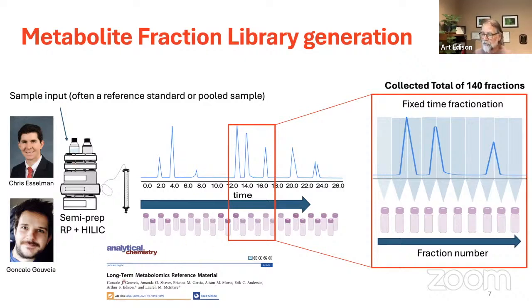I put down here at the bottom a reference from a paper that Gonzalo published while he was in my lab on defining a long-term reference material that I think many of you might find useful. I don't have time to go over the details of it, but you might look at that reference if you want to think about how to make a reference material for your own study.